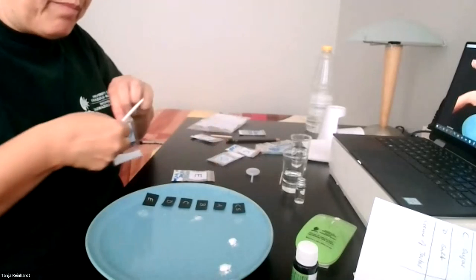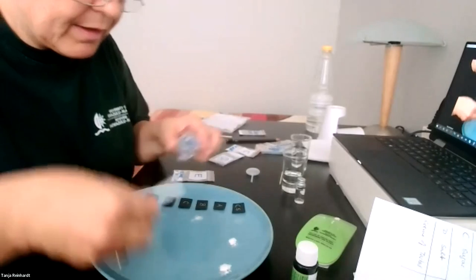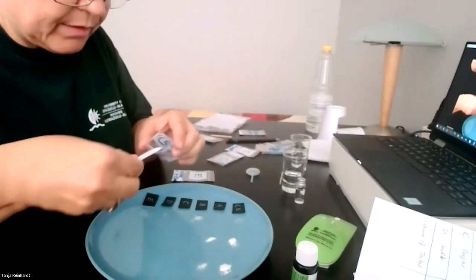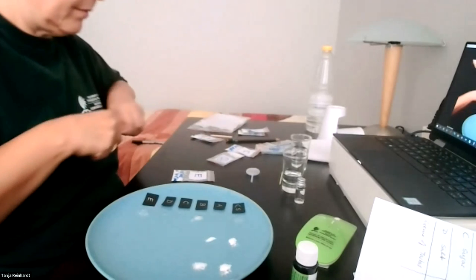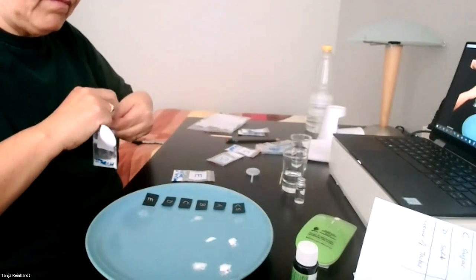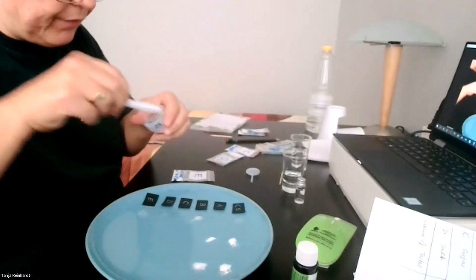Number A is our bicarbonate. And we're going to add a little bit more. Here we go. I'm going to wipe it clean. And now we're going to have our starch here from suspect B.